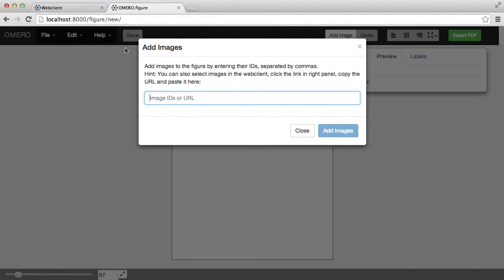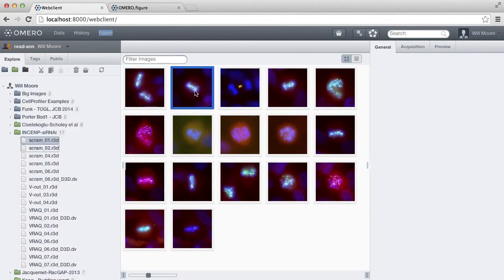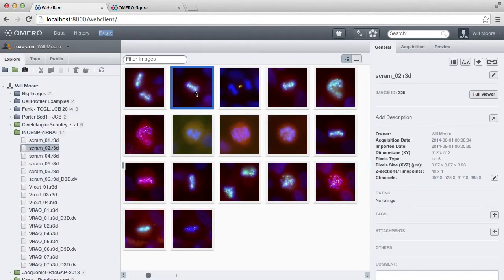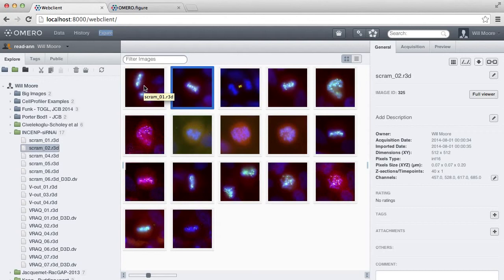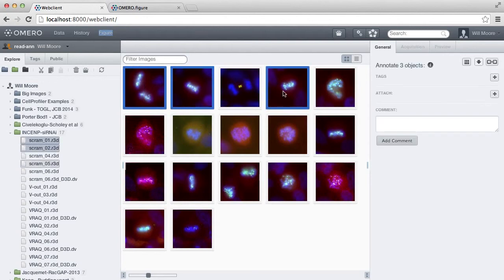So I'm going to go back to the web client and browse here to choose images. I can just enter the image ID, which is shown on the right here for every image, but a more convenient way, particularly for adding multiple images, is to select all the images I want and then use this link icon in the top right here.